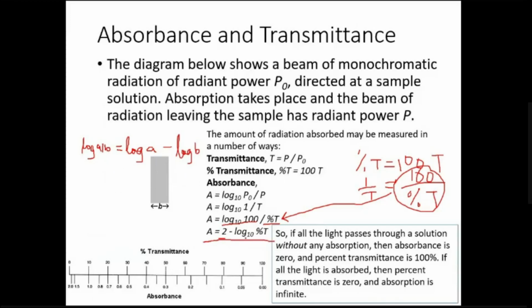Now, if this is the relationship which is established, please think about it: what may be the maximum value of absorbance? Okay, let us go logically to answer this question. No, Shweta. Shweta, think, what may be the maximum transmittance possible?